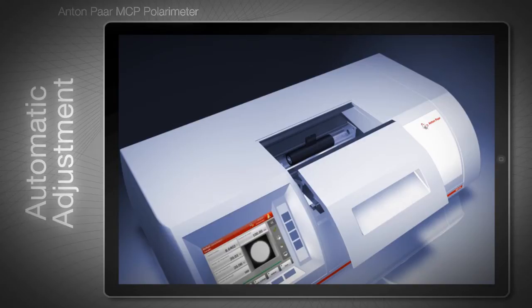Polarimeters need to be adjusted regularly so that the measurements are accurate. The MCP polarimeter uses certified quartz control plates as the standard reference. These quartz control plates look like sample cells from the outside. Inside there is a solid quartz plate whose optical rotation can either be certified by the PTB or traced back to the PTB standard.